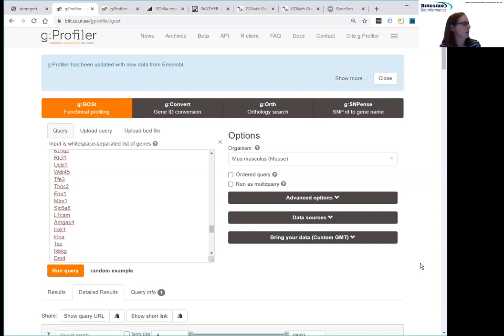And then when we've got a set of genes that are different between the control and the treated, we'd use that set of hopefully a few hundred to run through these tools and see if they seem to be enriched for certain biological functions. But these tools themselves don't perform any kind of differential expression analysis. They would just take some output from that.